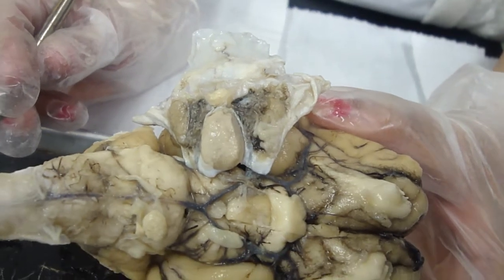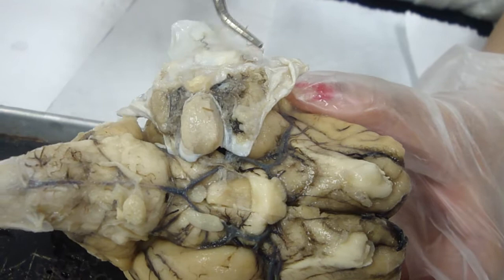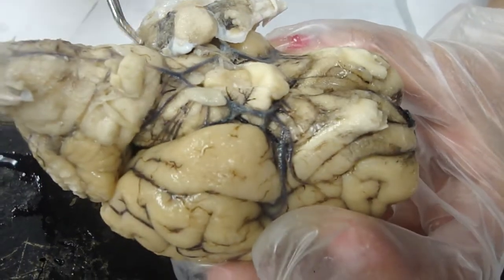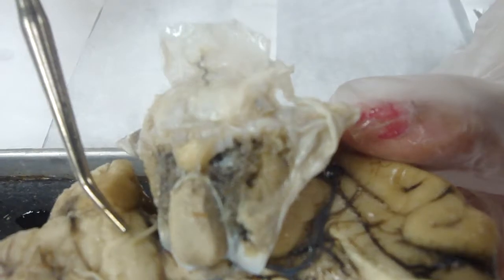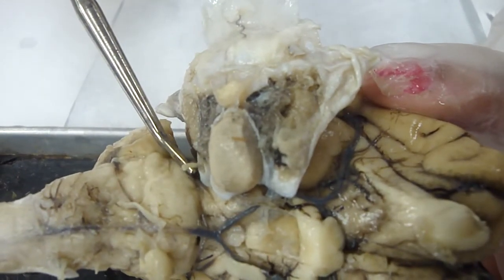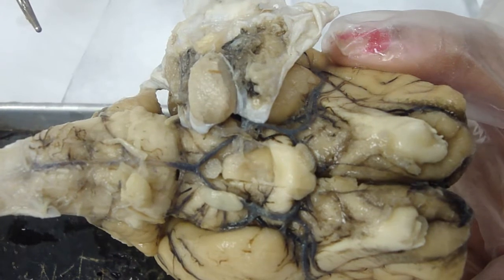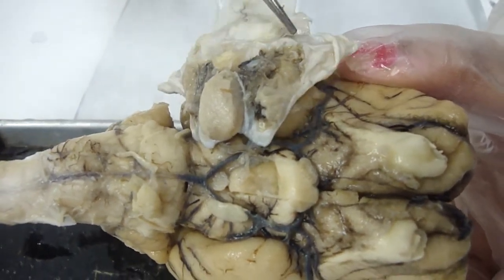But you'll need to be very careful in the way that you remove this membrane to preserve any small white fibers you can possibly see on this brain. For example, right here are two small cranial nerves. This happens to be cranial nerve pair number 6, the abducens nerve. And you can see that this is anchored to this membrane. There'll be actually several pairs of nerves that are anchored to the membrane. You have to locate those first, and be very careful to clip them away from the membrane before you remove it so that you don't lose the nerves at the same time. They're small and they're fragile.